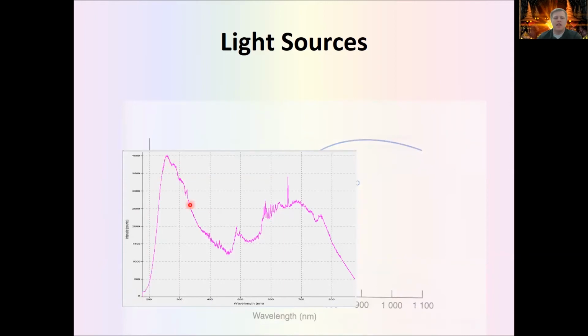So we've got the deuterium lamp over here giving us some UV, and then we've got our tungsten lamp that quickly falls off after 800 nanometers. You'll notice we also have a bunch of sharp peaks. You'll almost always get different peaks and shapes in these emission spectra depending on the individual lamp that you're using or the elements that you're using. For example, if a tungsten lamp is made from tungsten diluted with other metals, that'll change the shape of the spectrum. Sometimes you want to do that to get really fine control over the emission shape.